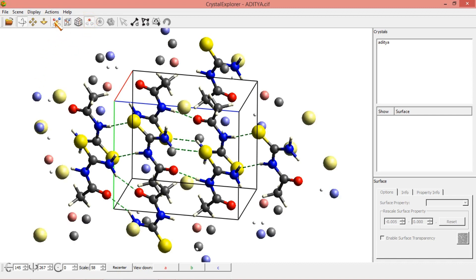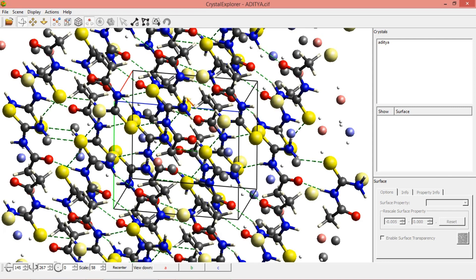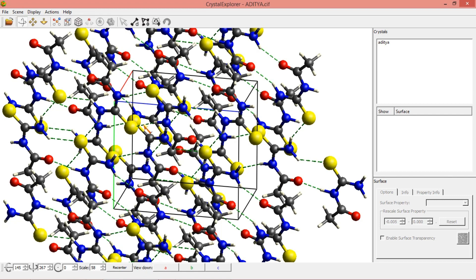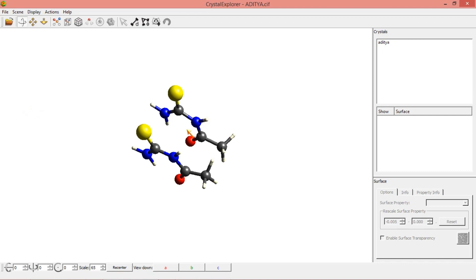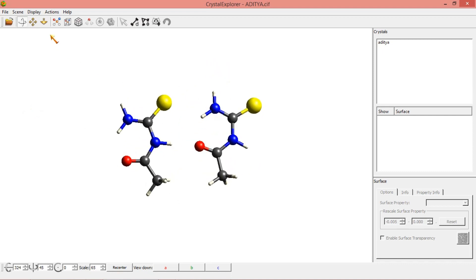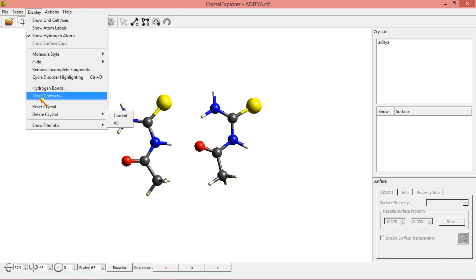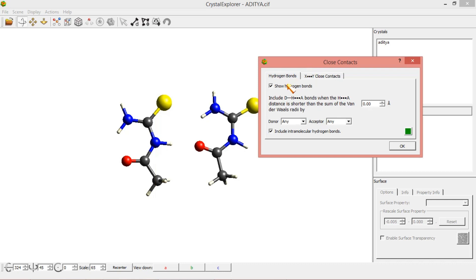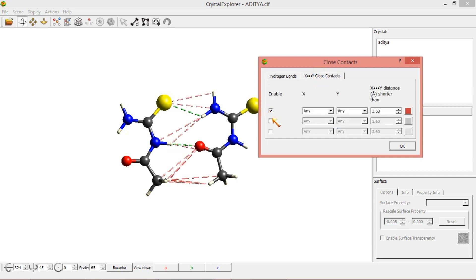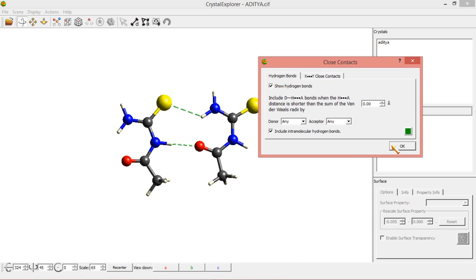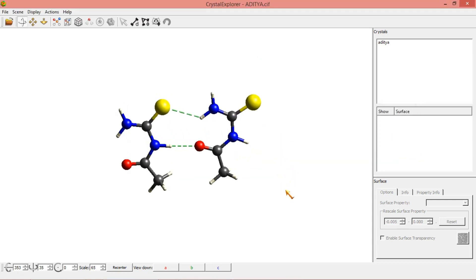After this, if you click this one you can form many molecules which will be forming inter and intramolecular interactions. If I want to reset this, I click Reset. Again I am showing you how to do it — go to Display, click Hydrogen Bonds, deselect and select again. You can see that close contacts are also formed here. Close contacts give more contact information, though this is not always necessary. I will show the packing structure again.